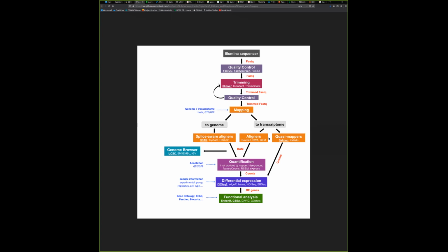We can also use genome mapping, but instead of approaching it from an expression point of view, we can align using Bowtie or BWA to get an idea of where exactly the reads map, and visualize at the transcriptome level or genome level what the expression of your transcripts looks like.